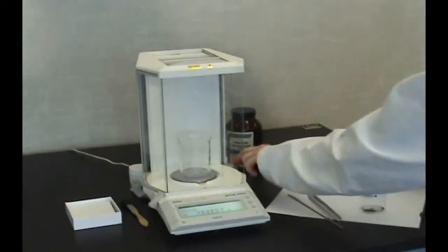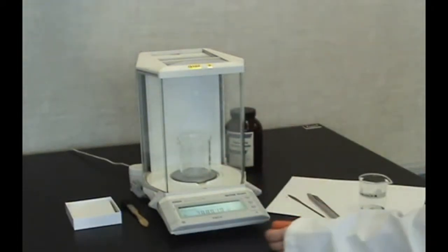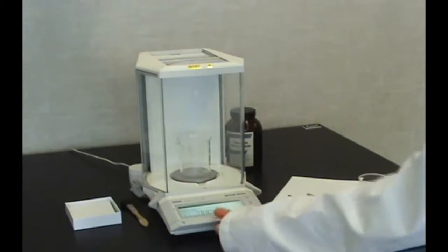Use an analytical balance to get a more accurate weighing. Tare the vessel.